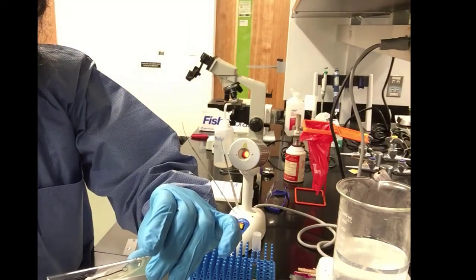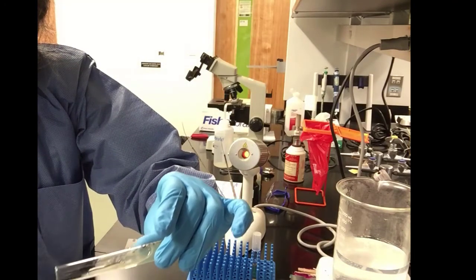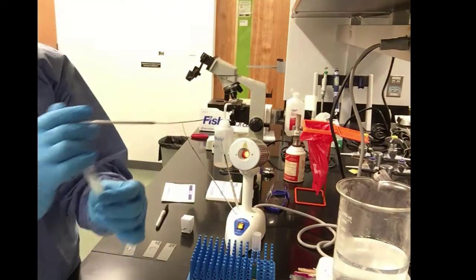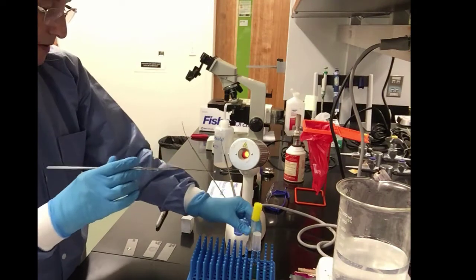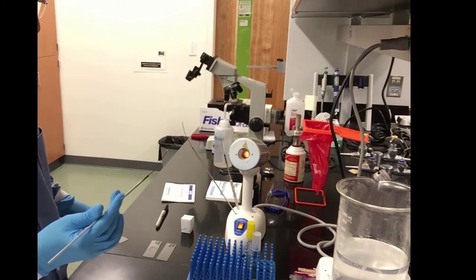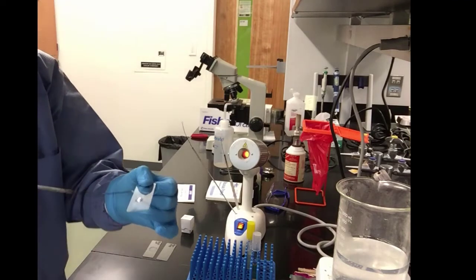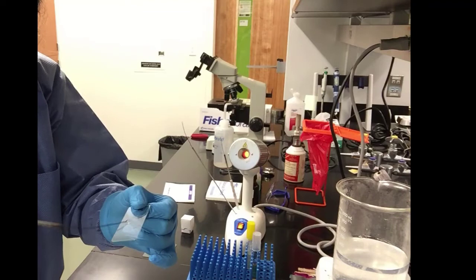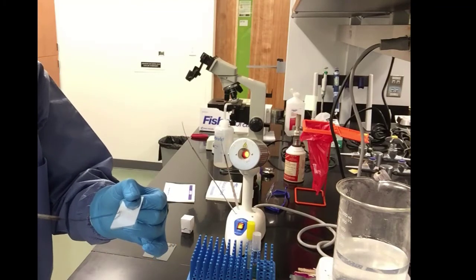Again, we go into the tube. You can see some of the slime there. I don't know if you can see it. There we go. And now we will place and smear the staph into the drop of water. Make a nice smear, quarter-sized.